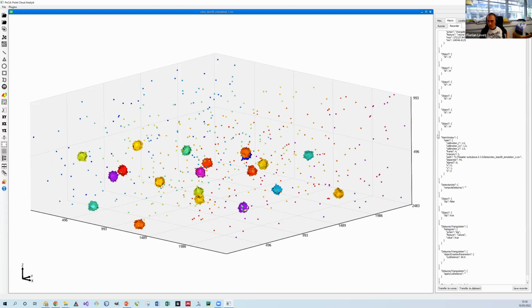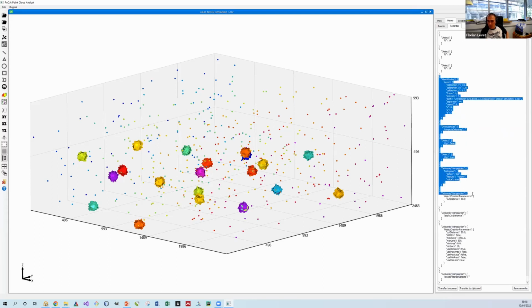Here I have opened some data. I have done a few things like clicking on the button, and that's what we see here. But this is opening the file, creating the Delaunay, creating the object. Now changing the parameter, applying the cutting distance, and then creating the object here.